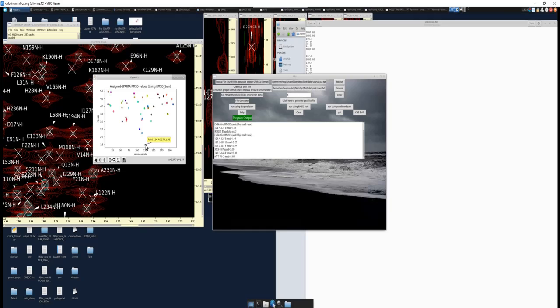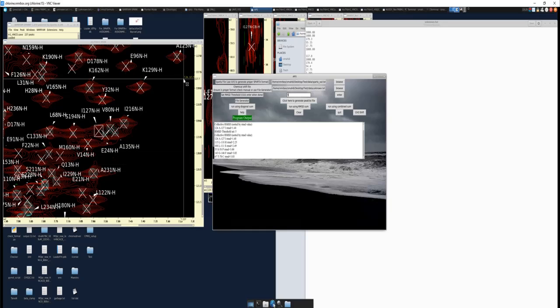And this is the strength of this tool, right? This allows you to basically search your sequence list and your Sparta Plus file and use those predictions to find the best match that you can get to assign your protein. So if you were assigning the protein normally, I think this is a good enough match with the data that you have to assign the section.